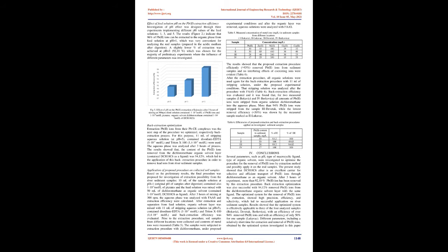Table 2. The influence of solvent type on Pb2+. Extraction experiments: the feed solution contained 1×10⁻³ mol/L of Pb2+ ions and 1×10⁻³ mol/L picrates. 50 ml of organic solvent contained 1×10⁻³ mol/L macrocycle ligand. Stirring time was 3 hours, rotation 300 rpm.